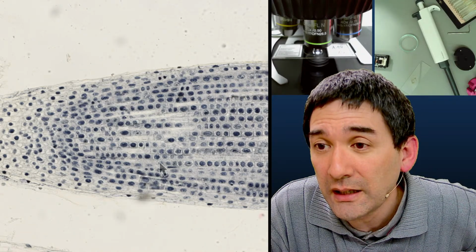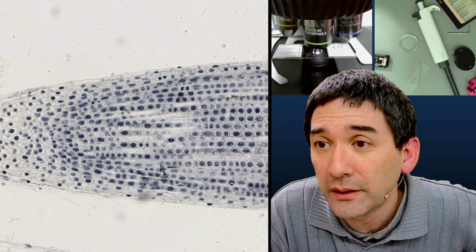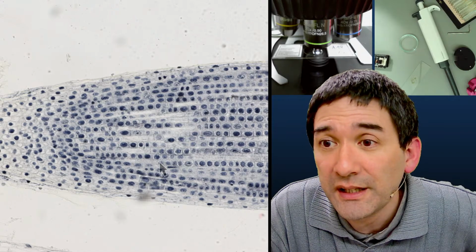Now we'll have to check again, okay? Yeah, so be careful with spiral-shaped bacteria, yeah? Of course, it depends which one it is.